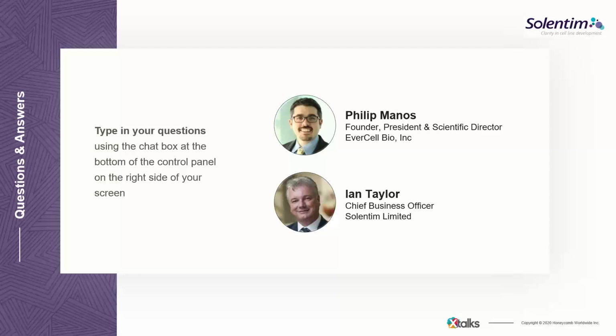Great, thank you, Phil. Another question for you: what is the most critical part of the workflow to optimize? That's another great question. I think it's somewhat of a trick question. For the VIPS instrumentation, optimization is really a balance between the droplet size and the amount of drops you're trying to make per plate. A lot of that is based on the needs of time and how many cells you need. You really don't need any optimization if you just need a couple of clones out of a whole plate. It's more about when you need to squeeze the most out of a certain application, where you might want to optimize those two particular cases.